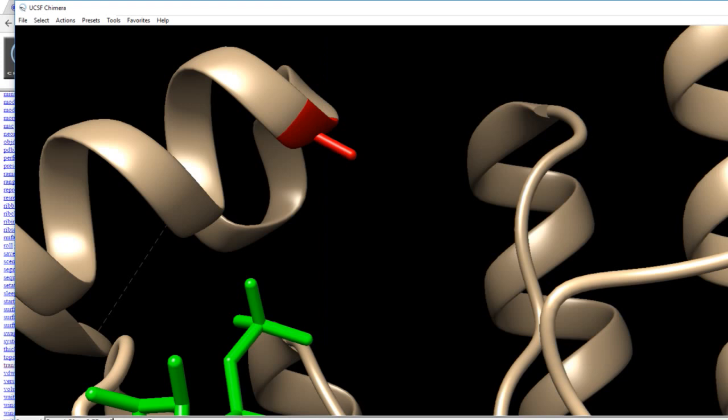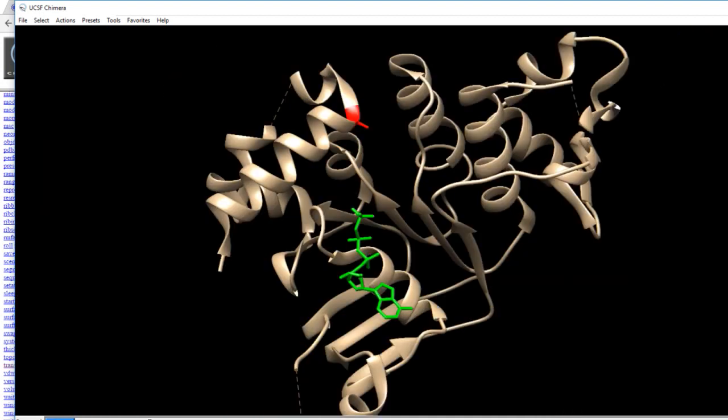If I put those two, just reset to pos 1, there we go, and let's find the fly. If I put a semicolon after it, I can put 2 commands on the command line. So then I can do the transparency. Oh, there's one thing I forgot on that command. I'll have to go back and edit that. Transparency 30, S, and I need to tell it I'm going over so many frames, 100. You can do it for just a certain part of the molecule. And if I run that, it'll do both of them together.